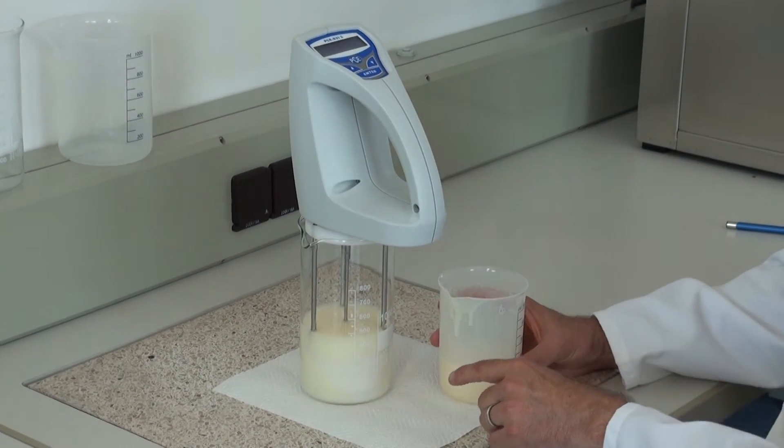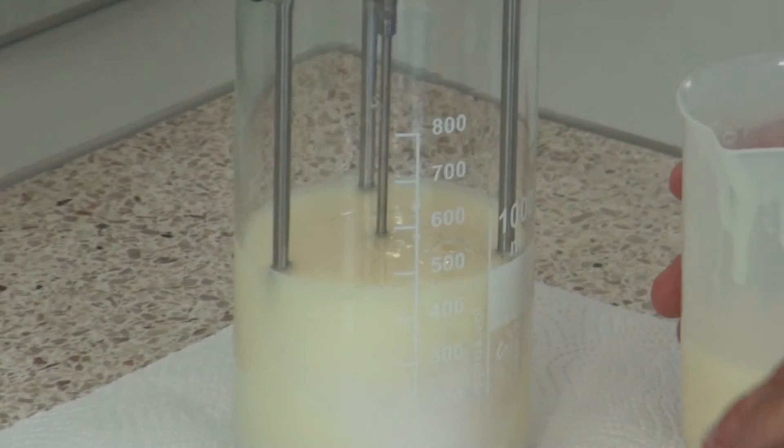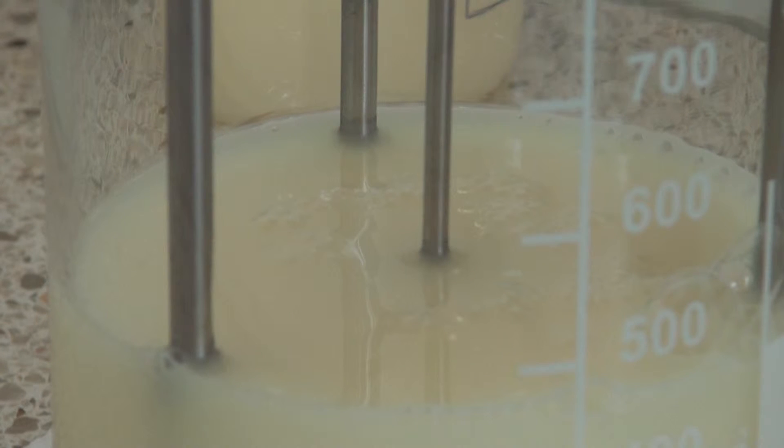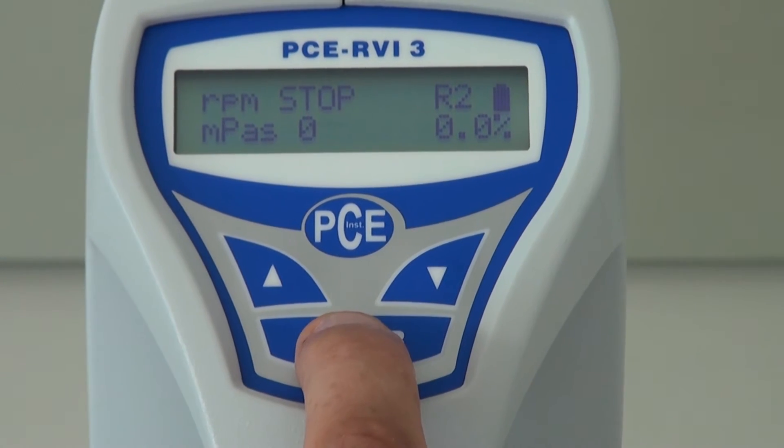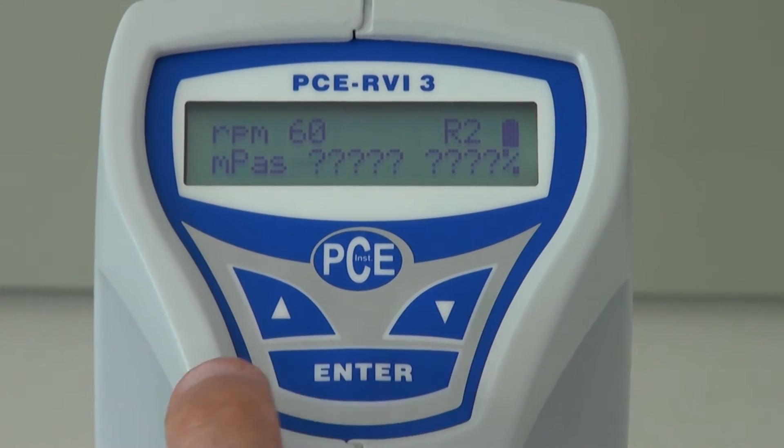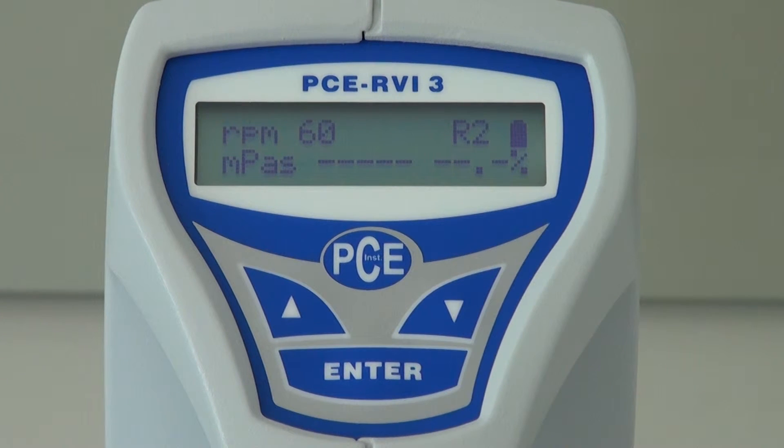Here is to observe that the filled amount covers the groove of the rotation body. By activating the enter key the measurement is started. First of all the rotation spindle starts to turn. Until a constant revolution is achieved. Here it is 60 revolutions per minute.